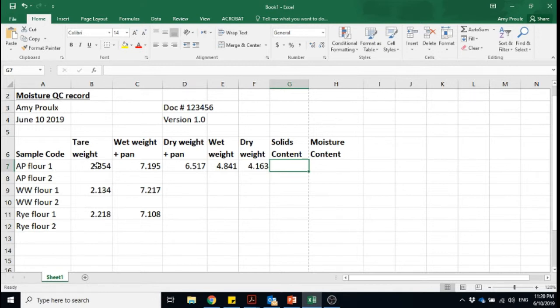So I've got the tare weight of the pan, and I've recorded it here. Again, keep as many decimals as possible. As you recall, I mentioned we wanted to add 5 grams weighed accurately. And so I do not need to sit and agonize and say, well, I need it to be exactly 7.354. The main thing is I'm measuring it accurately and I will be able to adjust for that variation.